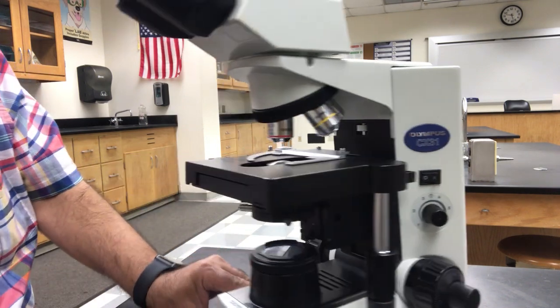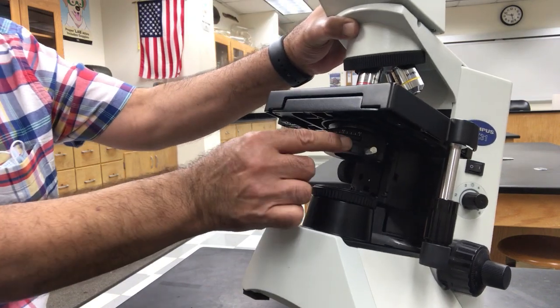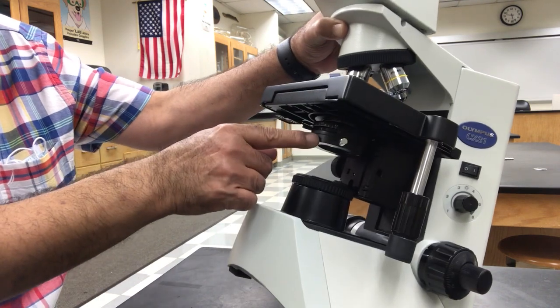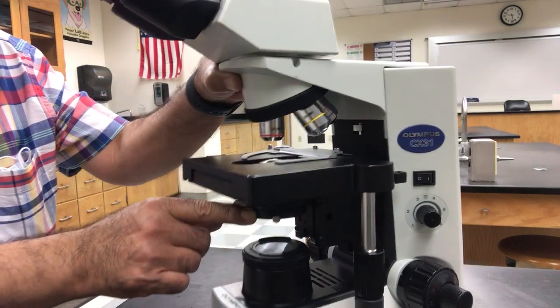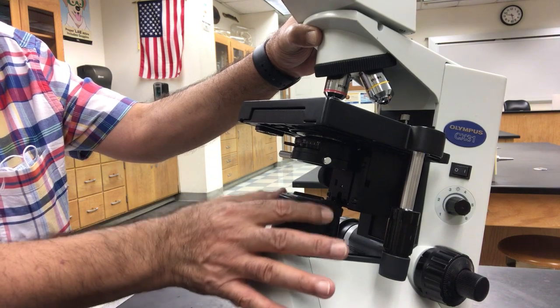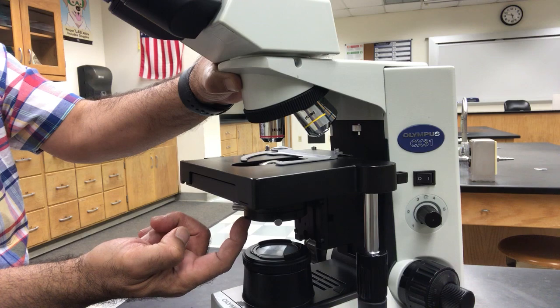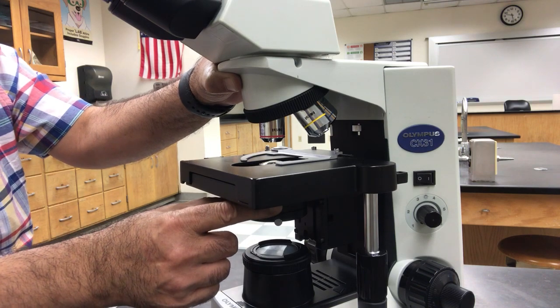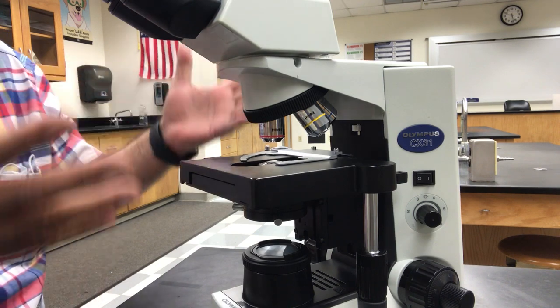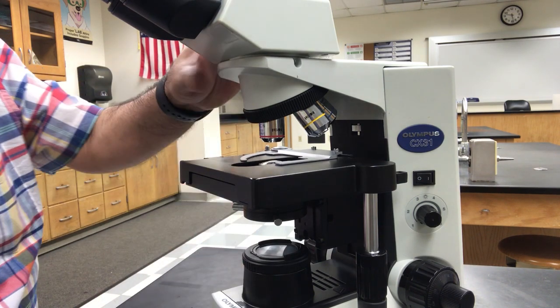Underneath the stage, you have a condenser. The condenser aligns the light beam from the illuminator or the substage light. This throws light up, it comes through the condenser and then comes out through the slide to illuminate the object you're going to look at.